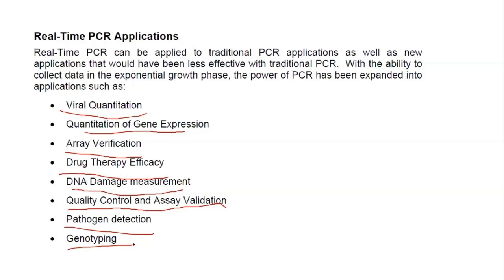This real-time PCR is one very good technique which has come out in recent times, and when you get a chance, you should all go for a workshop on real-time PCR applications, and that will change your entire idea of biotechnology or genetic engineering. It's a very important technique for you to learn hands-on.